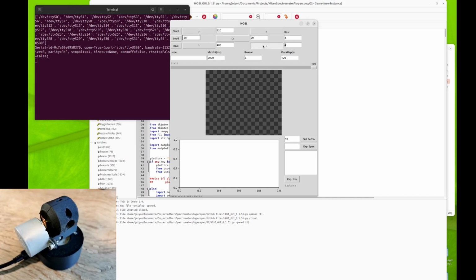And I can make it go to the bottom right point. And this will give us an idea of what the image is and what is being framed. And then get it to go back to its start position by clicking this middle button. When we change the resolution here, this little output thing will tell us the resolution of the output image. This will be 11 by 11 pixels.